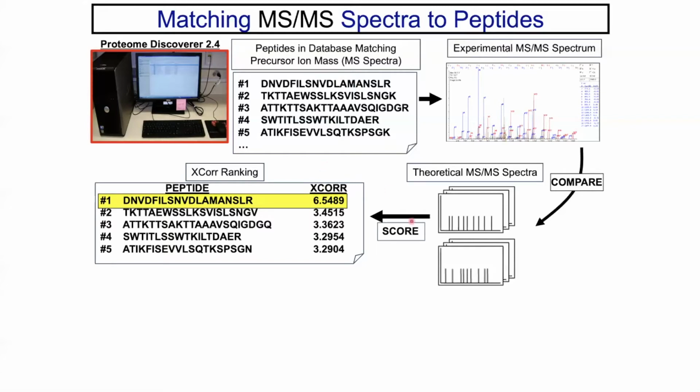And put simply, this is just matching up how many of the peaks overlap within, again, a particular tolerance window. So we still have mass tolerance for the MS2 data. And I'm focusing on this because we're going to talk about this a little bit in the settings, why that's so important. How close this is between theoretical and experimental is really important. And the more accurate the mass spectrometer that you have, the closer that you're going to be able to set that tolerance so that you have a really good filtering mechanism to be able to have a high quality identification.